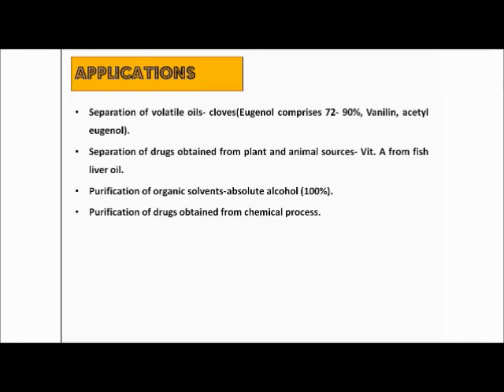There are different types of drugs which are obtained from chemical synthesis, right? So for purification of those components, because along with the drug molecule we may have other chemical entities which might get produced during that chemical reaction. Separation of those unnecessary or useless components can be done by using the process of distillation.